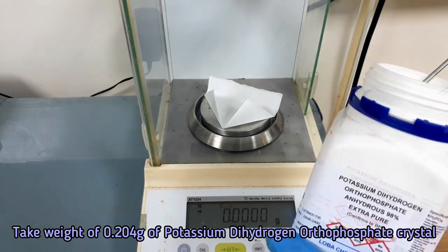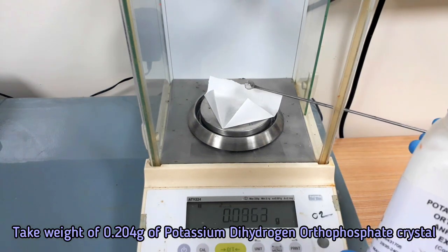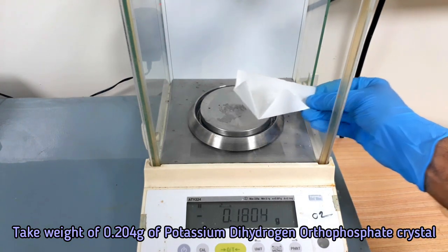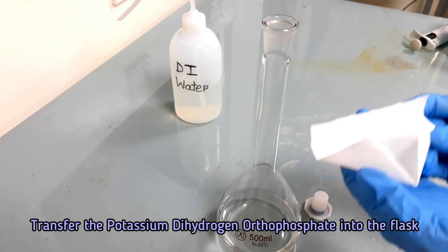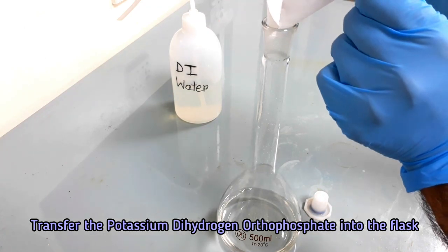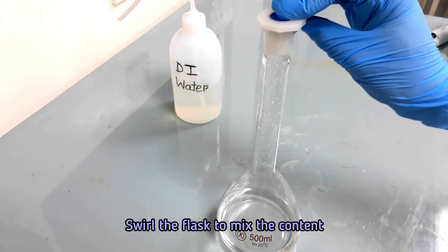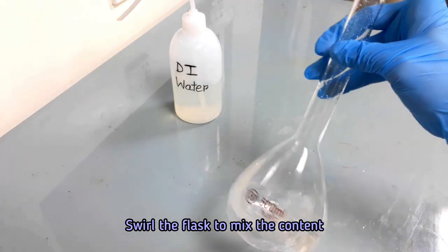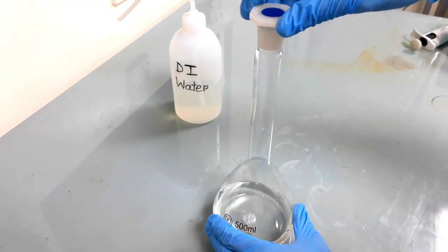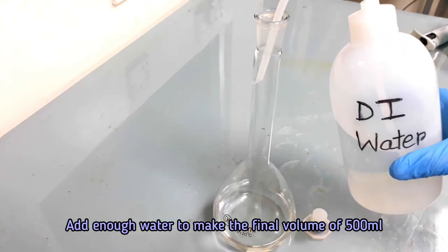Take weight of 0.204 gram potassium dihydrogen orthophosphate crystal. Transfer the potassium dihydrogen orthophosphate into the flask. Swirl the flask to mix the content. Add enough water to make the final volume of 500 ml.